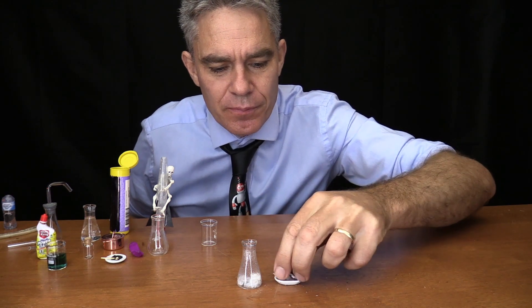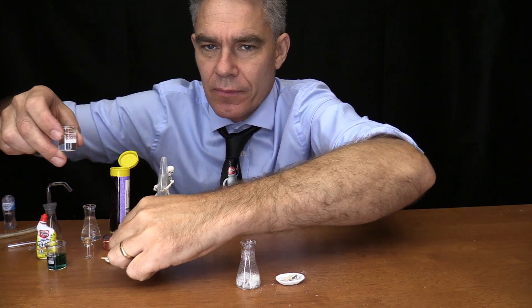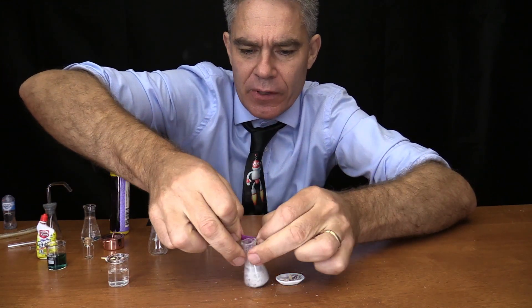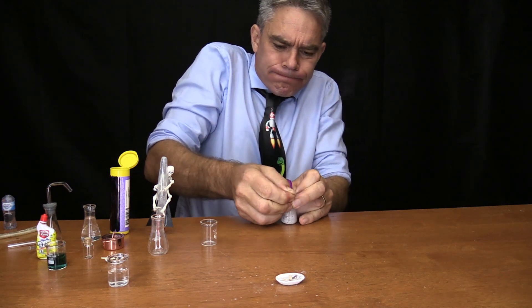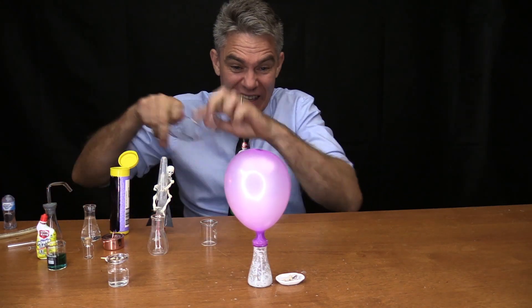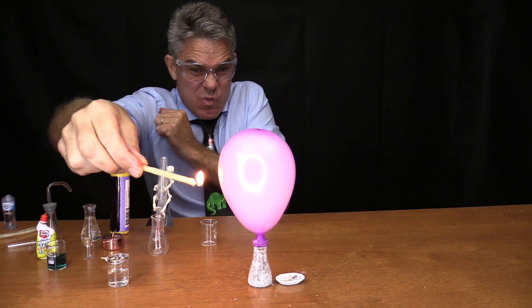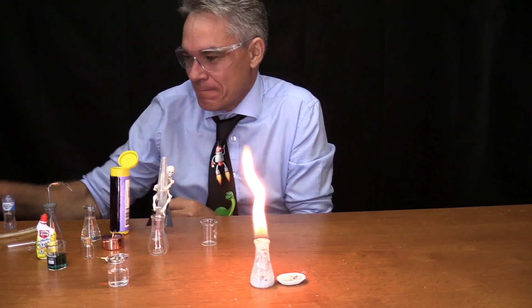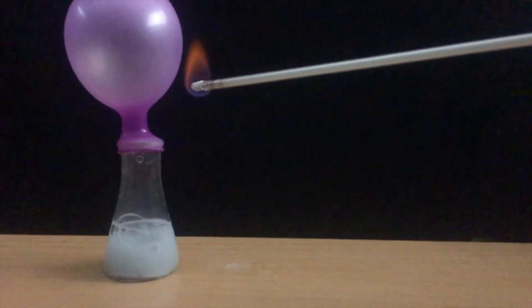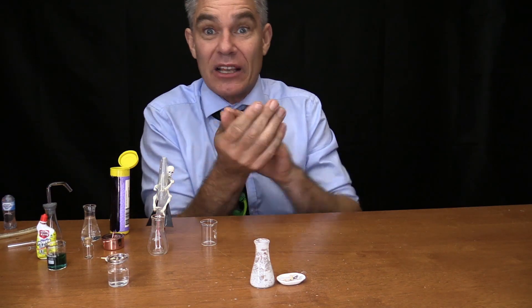I'm going to put a bigger chunk in this time, and some more water, because this time we're going to put a balloon on it. Let's get the water in and see if we can use this gas. Look at that balloon! I'm going to put my safety glasses on. Very incomplete combustion though — did you see all the black soot that came out? In fact I've got a bit of black soot on my hand.